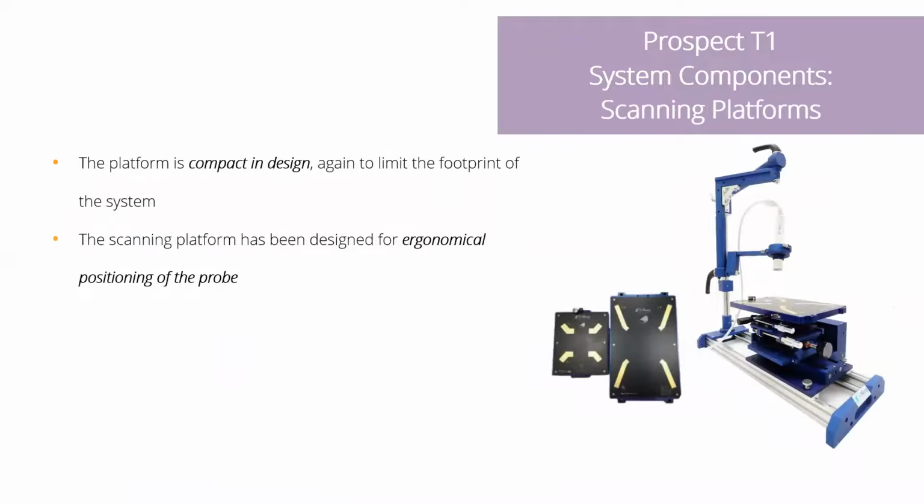The platform itself is quite compact, as you can see here. It is designed for ergonomic positioning of the probe. There are different levers that are released to allow you to rotate the probe really on any angle to be able to get the images that you require.